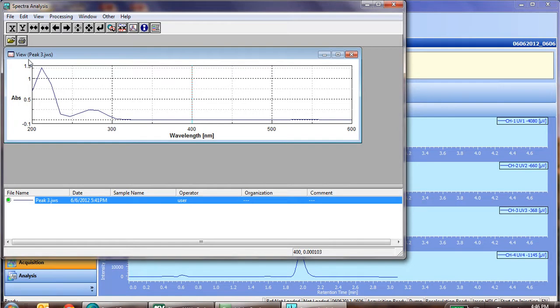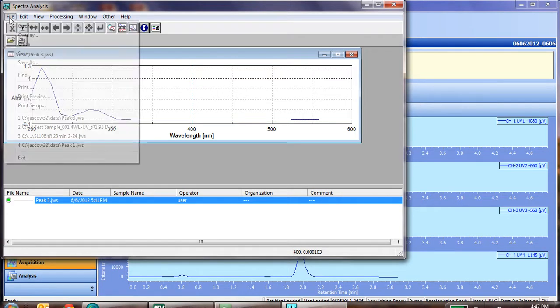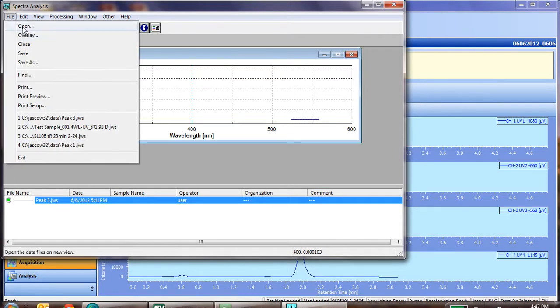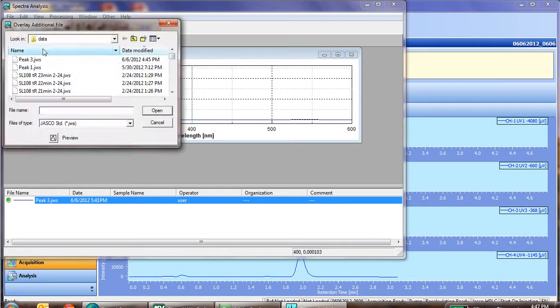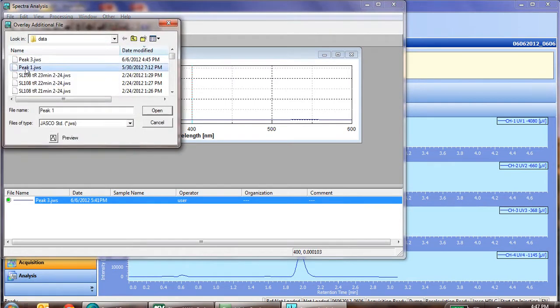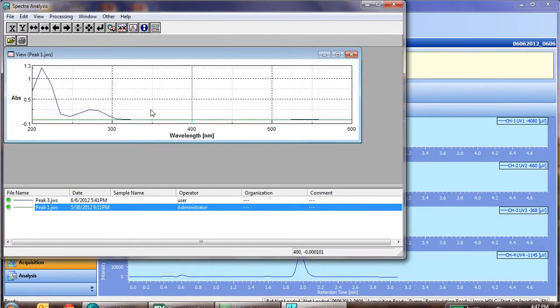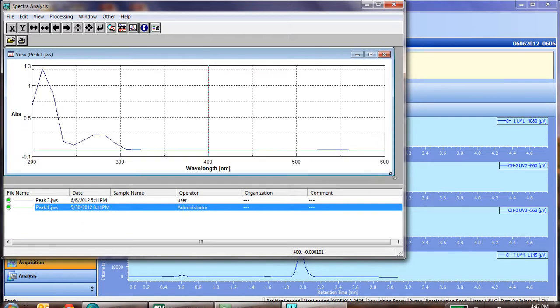Now if we want to overlay a peak, such as with another peak that is eluted, or the same peak during a different run, simply click file, overlay, and pick the peak you want to overlay it with, or spectra you want to overlay. Click open, and now you'll see this particular spectra has been overlaid.